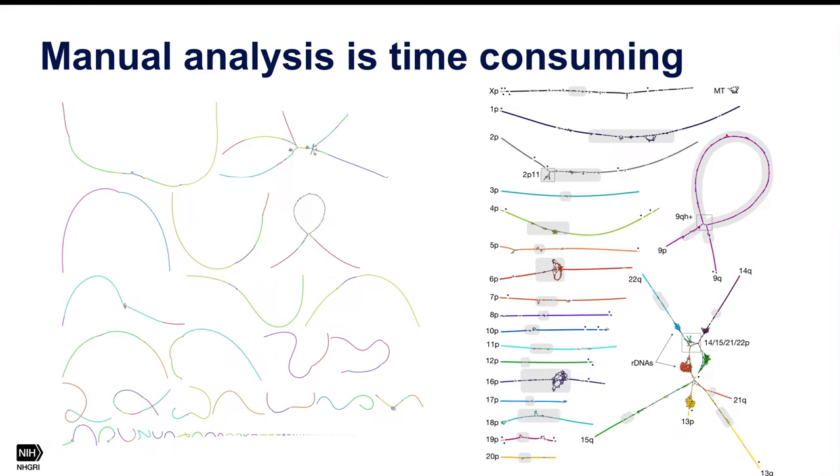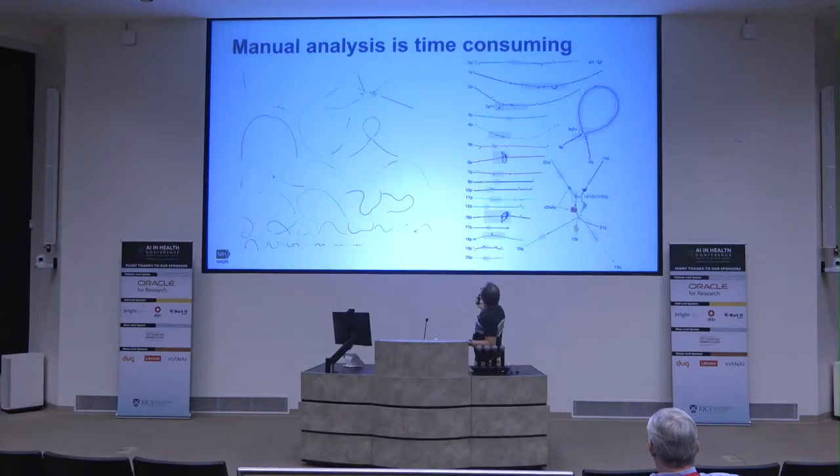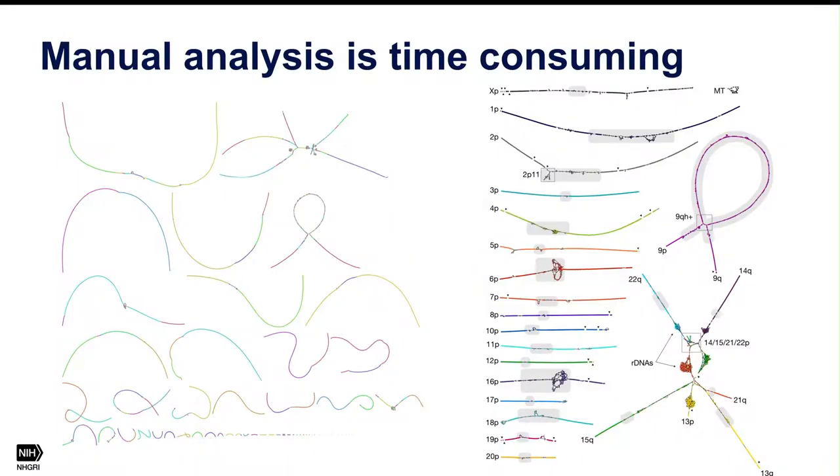And then for all these bits that are in gray, these are the human repeat arrays, whether these are alpha satellite like centromeres or human satellite 1, 2, 3. And so you have to manually go in with ONT data and other manual analysis and untangle this big bit of hairpin-like messy spaghetti structure, right?